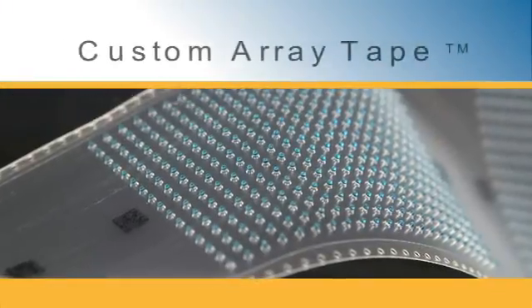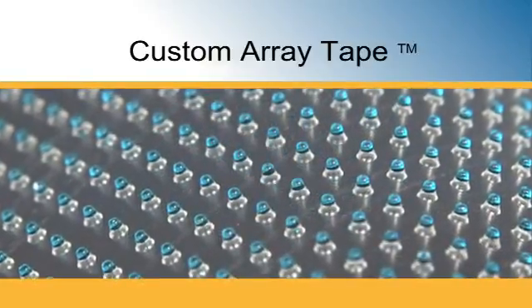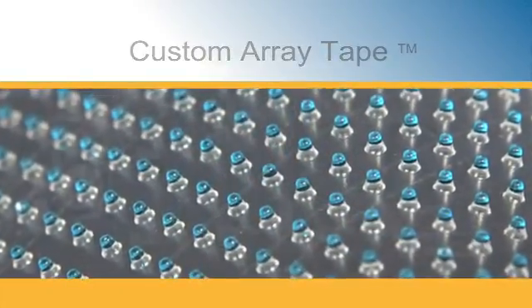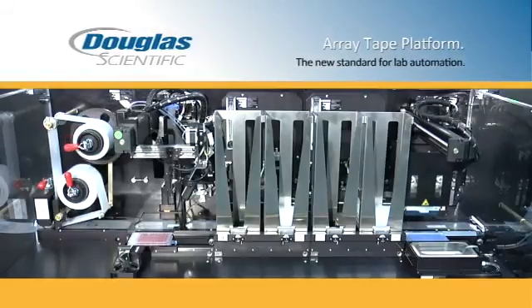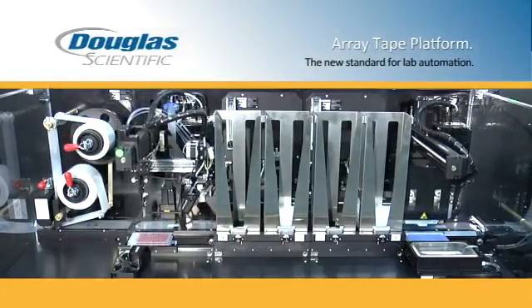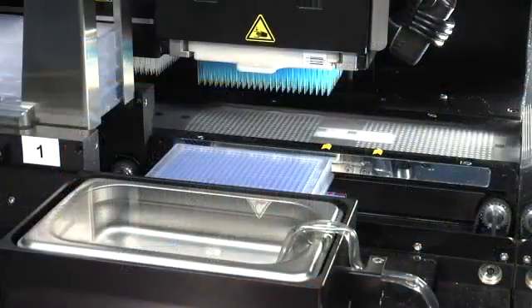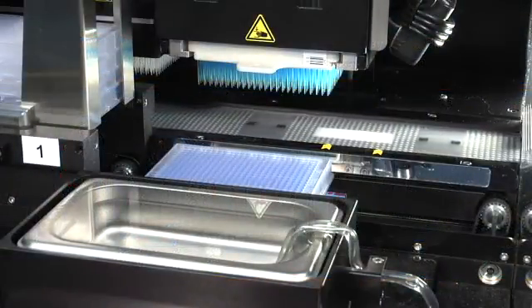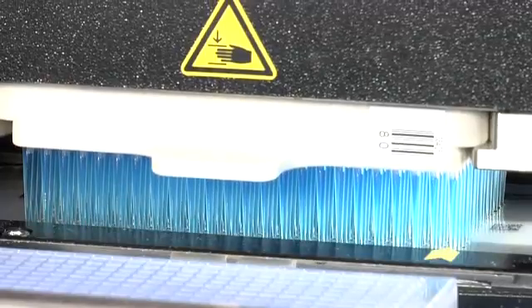ArrayTape is a continuous polymer strip serially embossed with reaction wells in customized volumes and formats. The Douglas Scientific platform enables you to analyze more than 300,000 data points in a simple three-step process. The first step is to fill the assay in ArrayTape. This step alone can reduce your reagent costs by 80–90% with miniaturized reaction volumes.